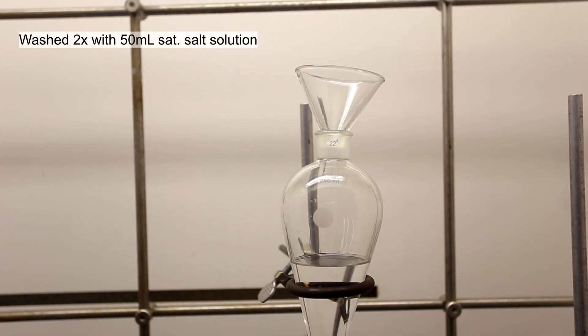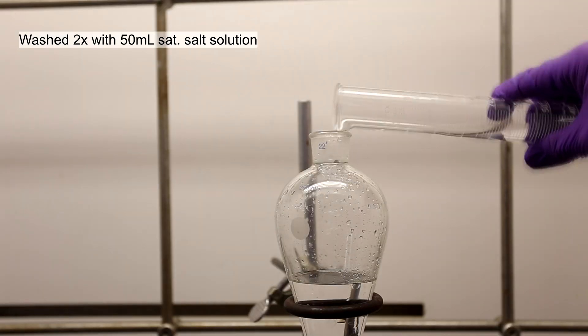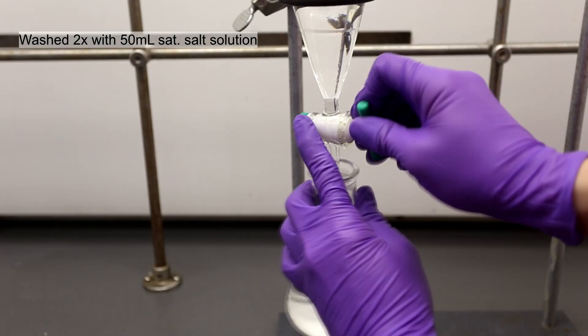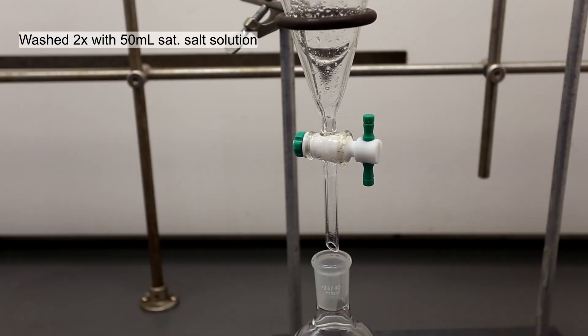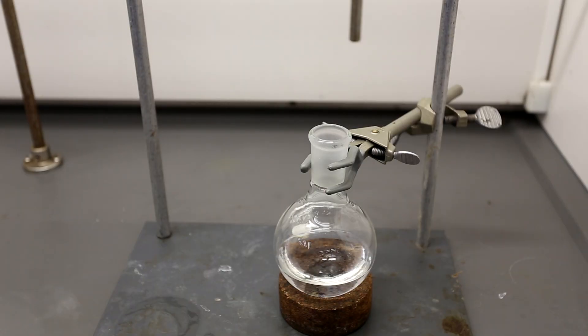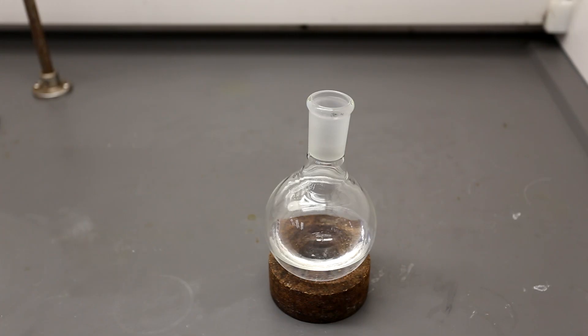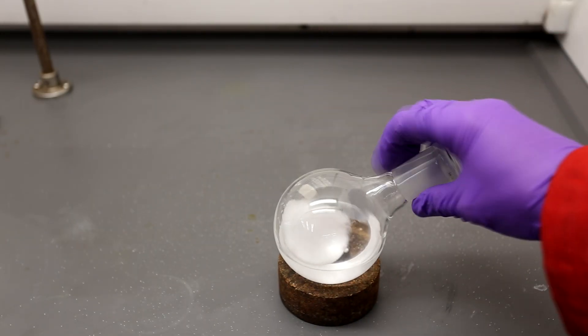The combined ether layers were then washed twice with 50 milliliters of saturated salt solution to dry it. The ether washings were then drained into a round bottom flask and dried using sodium sulfate.